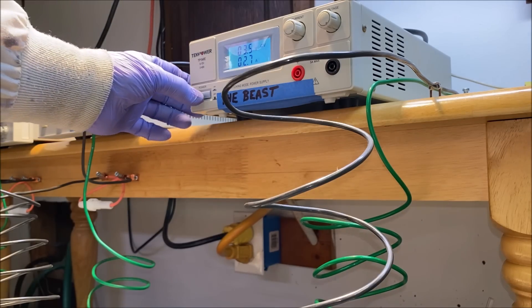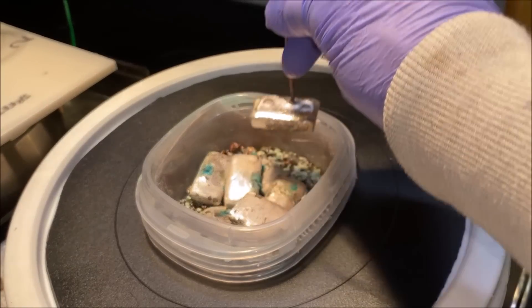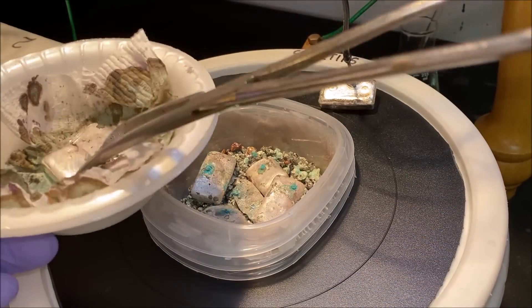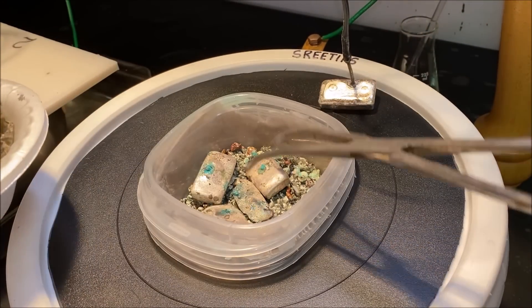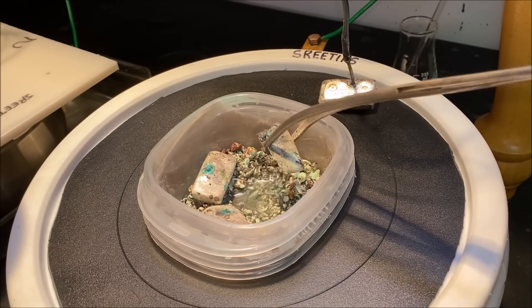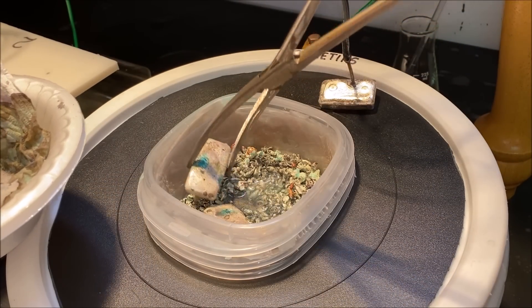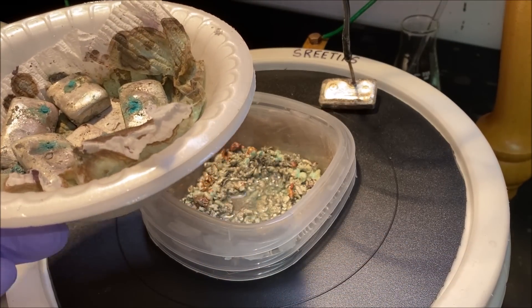Turn the power off on the beast. Now we'll come down here and remove these loose bars of silver that I use as a buffer between the electrolyte-soaked impure silver shot. It's down in the bottom of this anode basket — you can see that liquid down there. If it's allowed to come in contact with our anode bar, it will dissolve it. So I put these bars in there to act as a buffer.